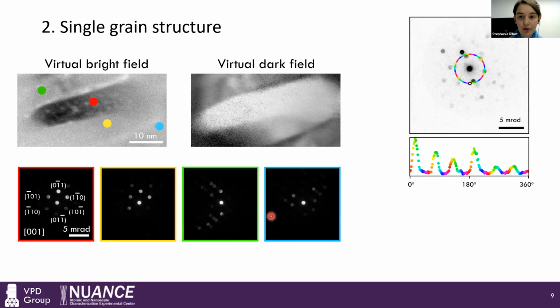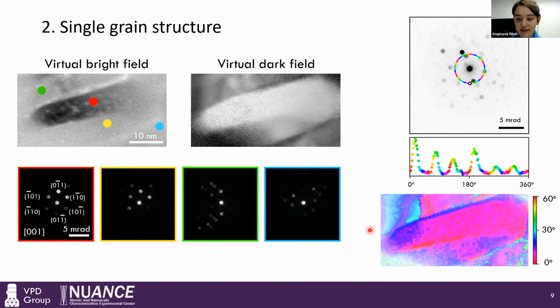Before we do that, the first thing we're going to do is, as before, probe the orientation within the plane of the sample, and we end up with a map that looks like this. Again, this is the core of the grain. We set this at 0. And around the core, you see some rotation away. And then especially at the intergranular region, you see more rotation around your crystal.